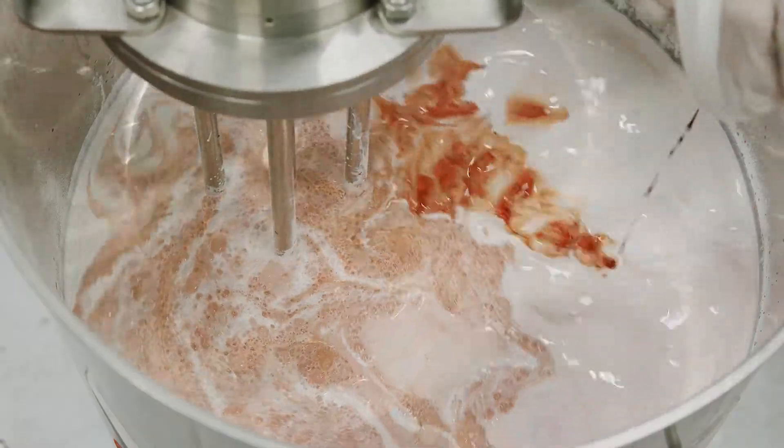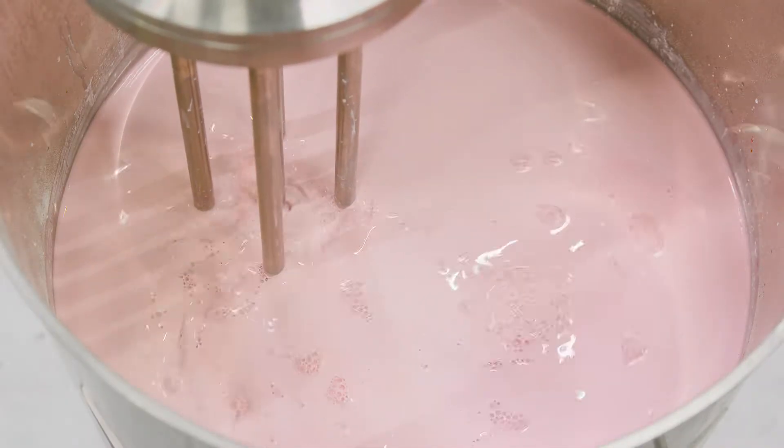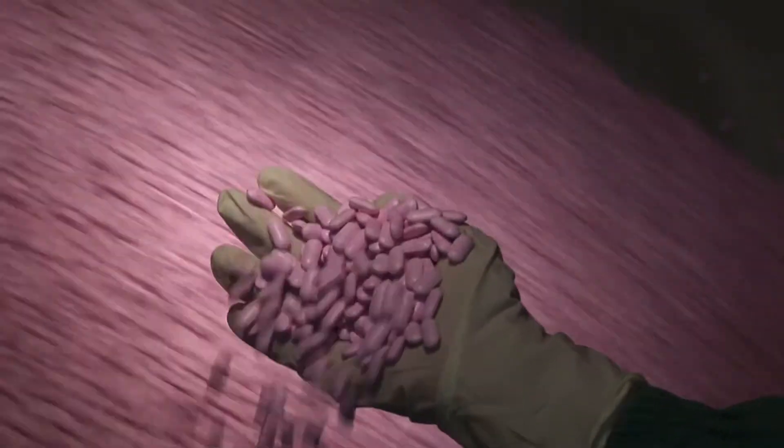The high shear action of the Silverson mixer ensures particle size is minimized and complete uniformity of the batch is achieved, preventing any issues with flecking from uneven dispersion of colorant. The solution is completed in a fraction of the time taken by conventional mixers, and batch-to-batch consistency is assured.